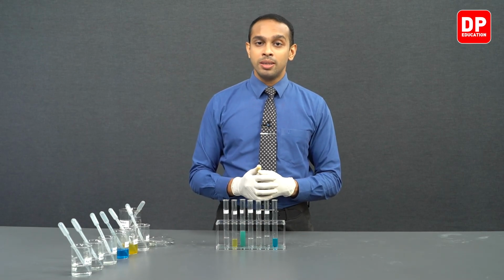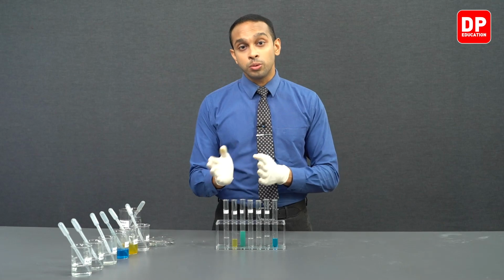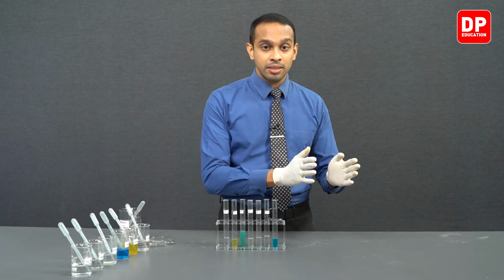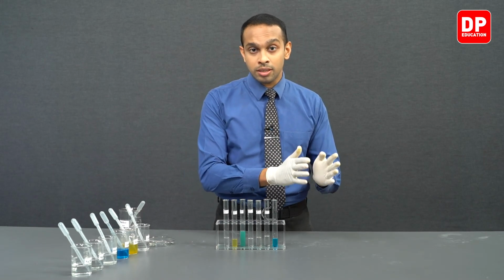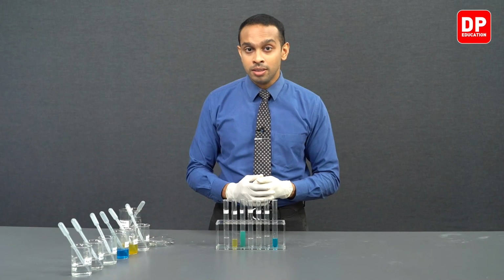Keep in mind, when the reaction is taking place, copper gets reduced from copper 2 plus to copper metal, and lead metal gets oxidized from lead solid to lead 2 plus, and the copper precipitate will be prominent here.